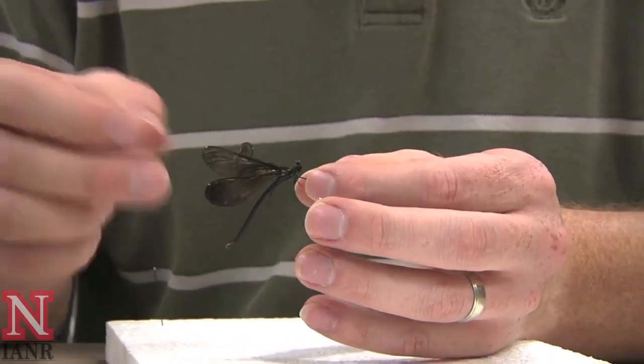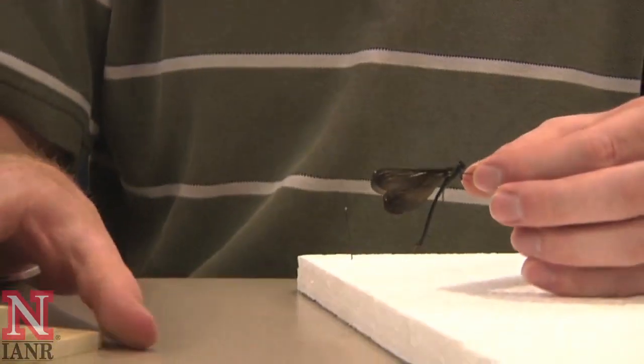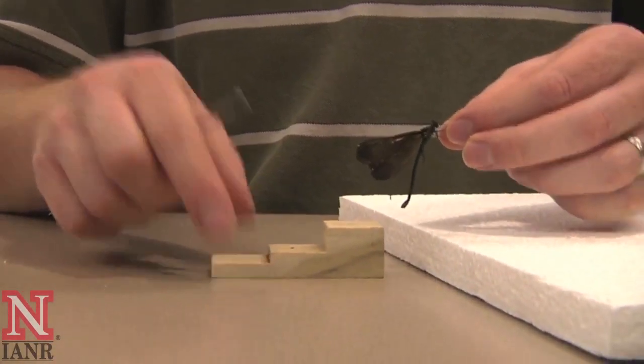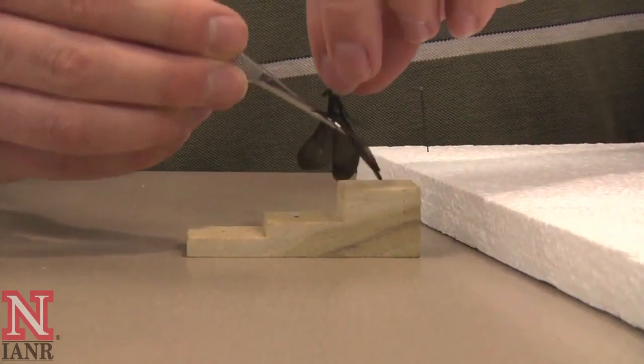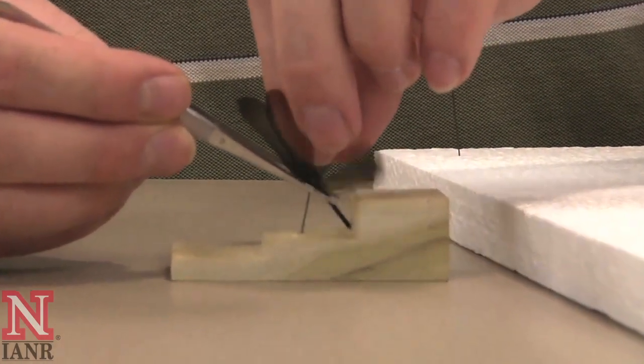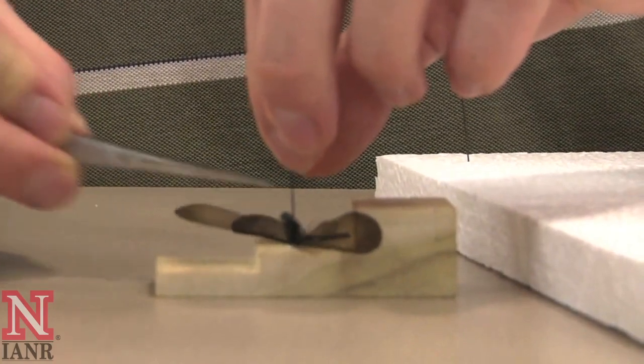Sometimes the wings will bend during pinning. When the specimen is fresh, there's nothing to worry about. Take your pinning block and insert the pin at the correct height — in the brassica, this is either three-eighths of an inch or one-half inch from the top of the pin.